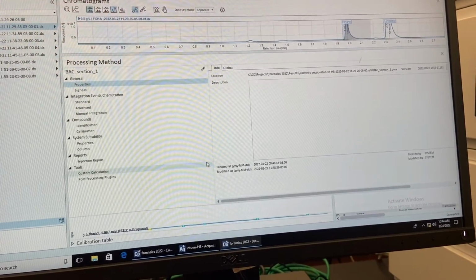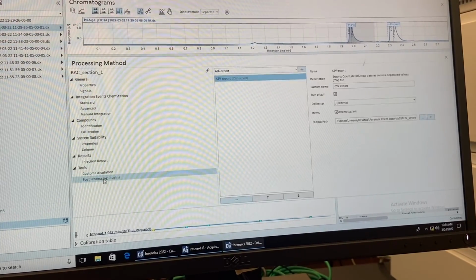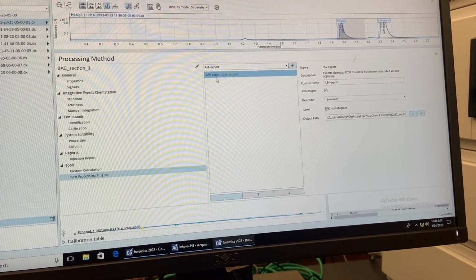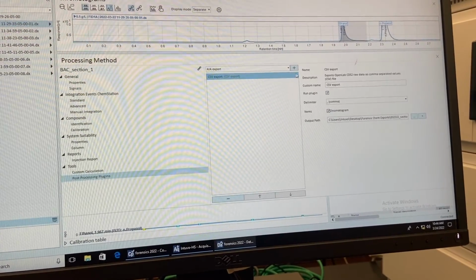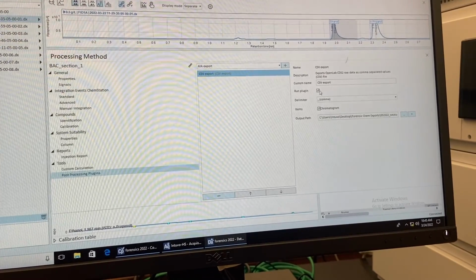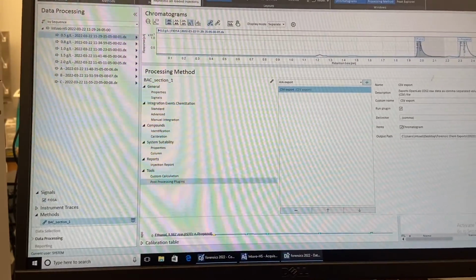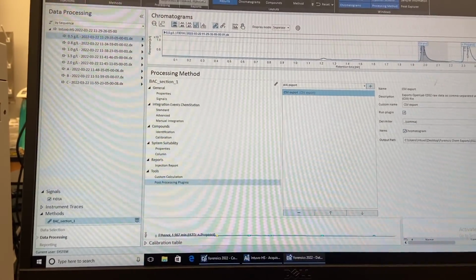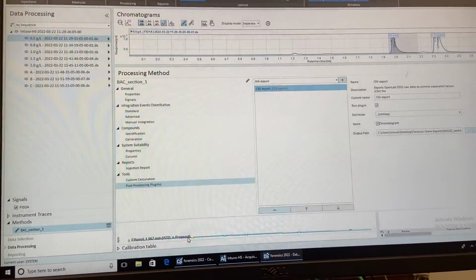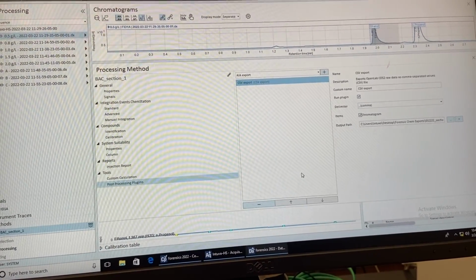All I need you to do is save your data. You're going to export your data as a .csv. So you would go here. It's going to be already CSV export. You can actually add one by clicking that, but it should be done already. You would hit run plugin, and then you would hit this button right here, reprocessing all, and that will automatically save it to our folder, which I will save on a USB and post on Canvas.